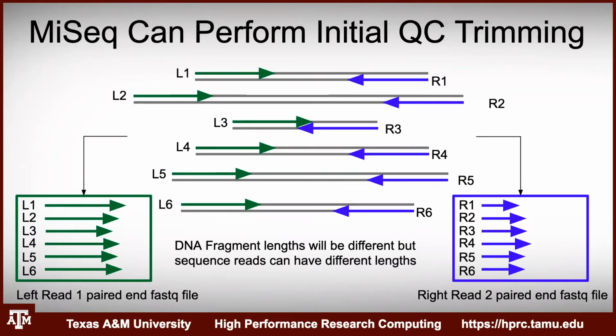So that's something you need to check before you do anything downstream like mapping. You're going to want to do a QC, look at the reads and see how's the quality? Do we need to trim any adapters? Just how are things looking? It's important, and there's quite a bit of variation between labs on what they do. Even within labs, sometimes data just gets handled differently.